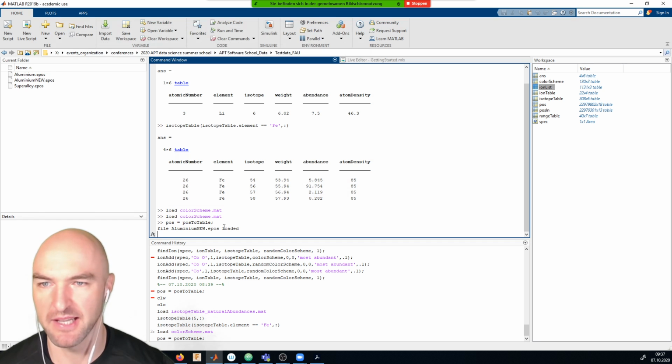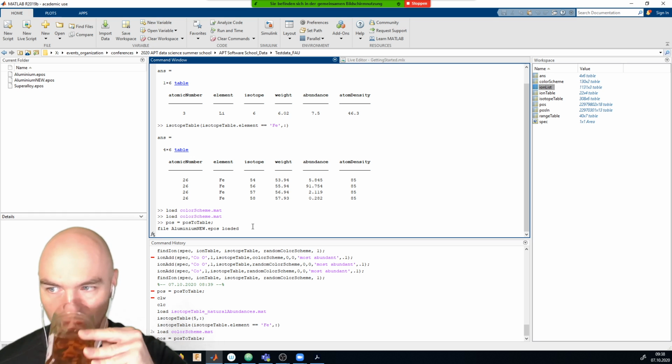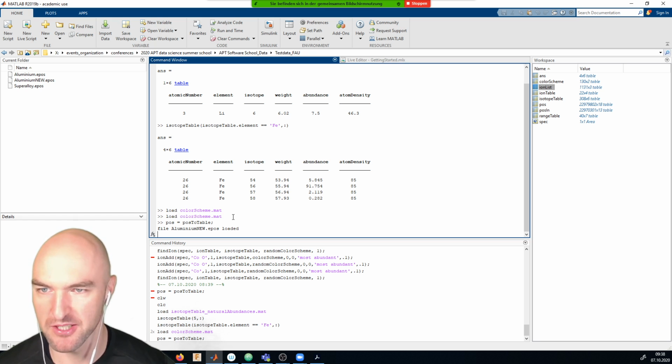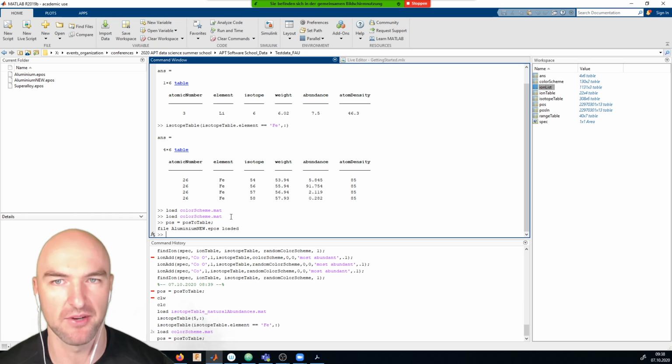And you can see right now it's still loading. It's a relatively large data set. I think it's a pretty nice data set. And once that's done, we can just easily open it. I think everything's a little bit slower right now on my computer here, just simply because I've got OBS and the streaming and everything running. That slows stuff down a little bit.